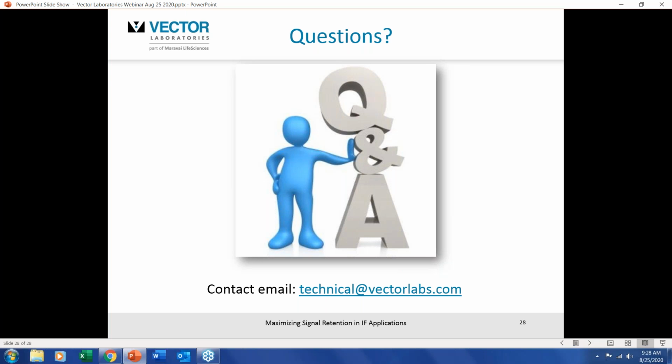The next question is, how do I minimize background aside from spinning the secondary antibody aggregates? Yeah, that's fair enough. Certainly our first webinar, I'll go back six weeks now, was addressing troubleshooting background in these applications, immunohistochemistry and immunofluorescence. And importantly, the key thing is to identify the source of the background, or indeed sources of background.